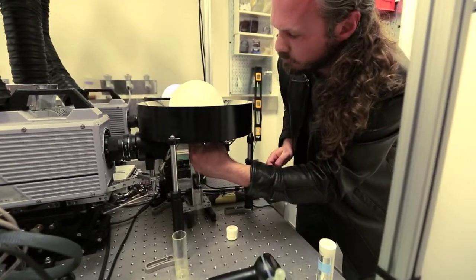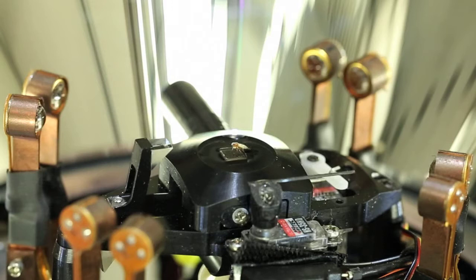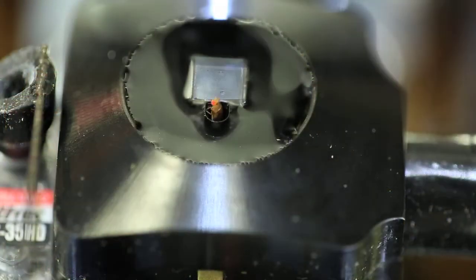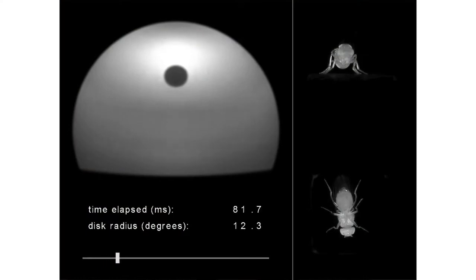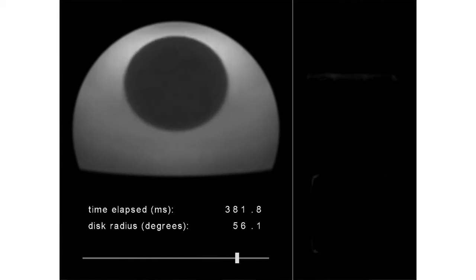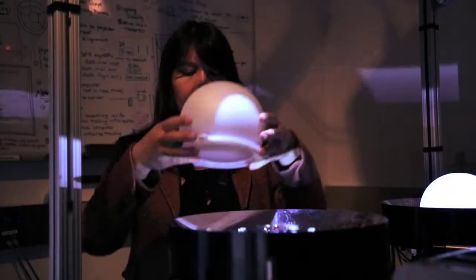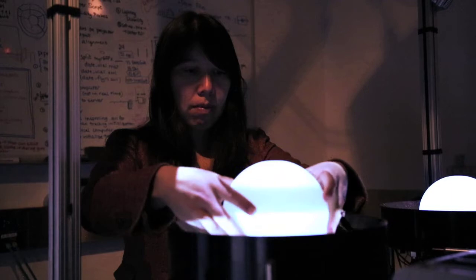This enables us to bring a fly one at a time up onto a filming platform where we can capture the fly's response to a video of a predator approaching, and we can record the fly's response at 6,000 frames per second.